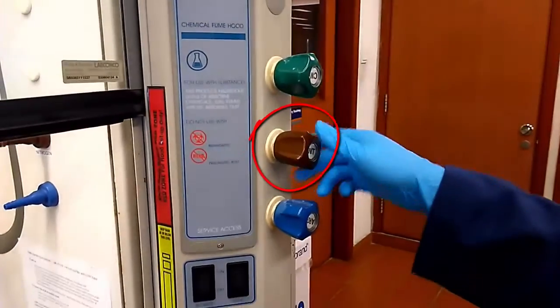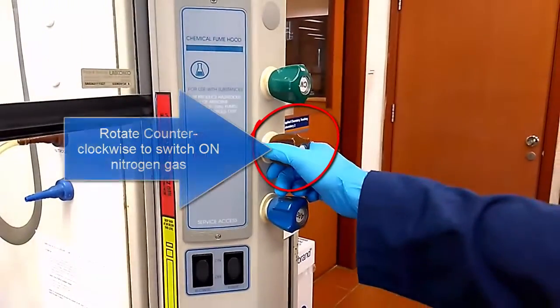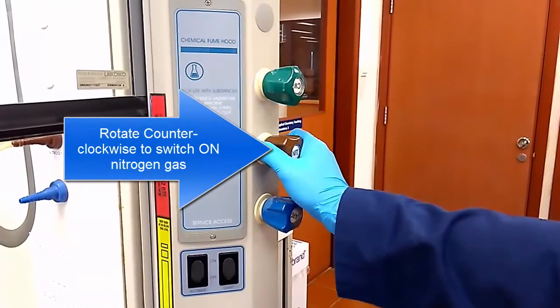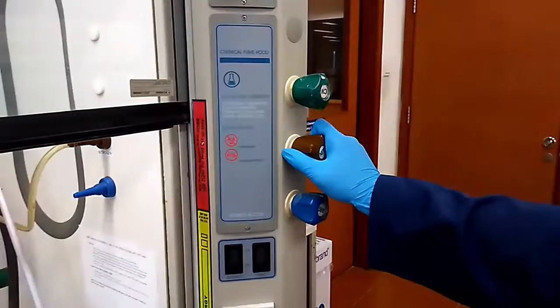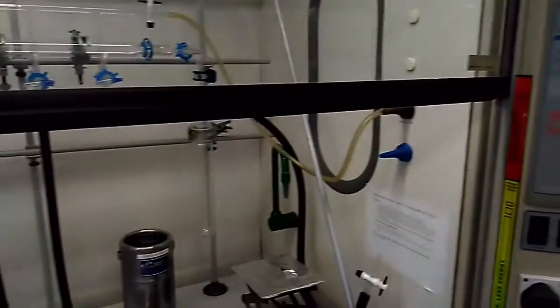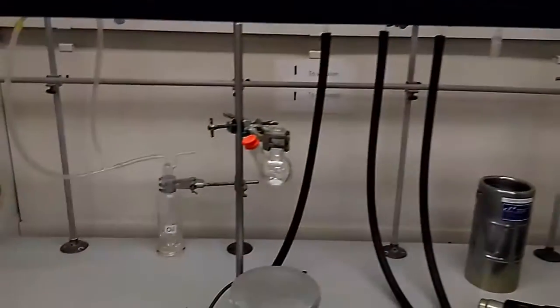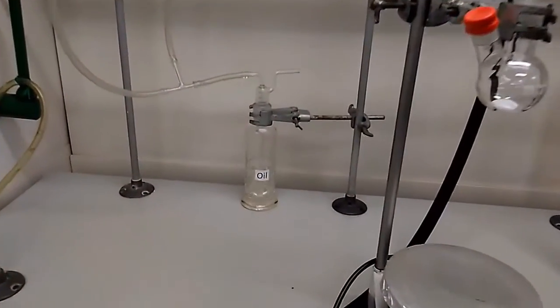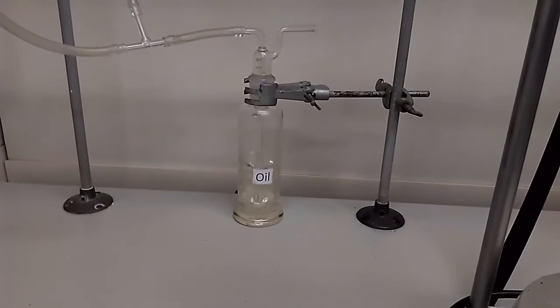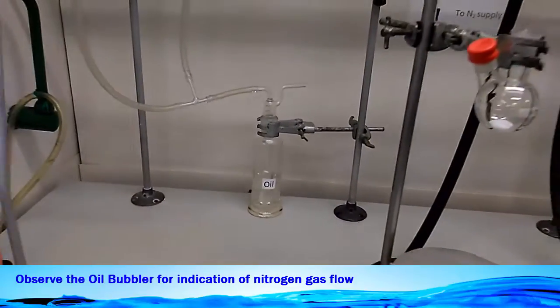So you see this brown knob. This is a nitrogen source. You rotate carefully, turn it on. Make sure that the nitrogen is going in. And how do you check? You have the oil bubbler on the left-hand side. Here you see there's intense bubbling to show that we have nitrogen gas going into the two-way manifold.